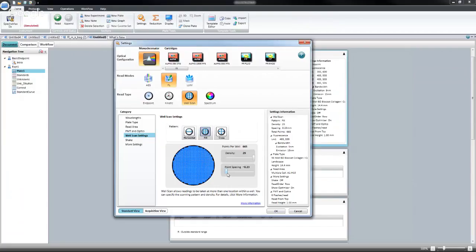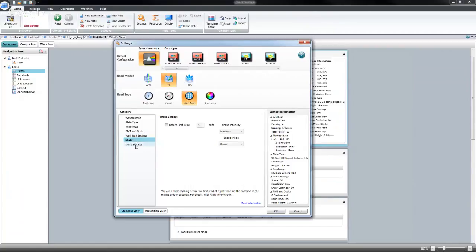And of course, it's really great. You can get a great idea of what's happening in each individual well here. But you can also space this out, which is a little more common, as it's not going to take that amount of time to read over 600 points. If you want to do, say, down to 12 here, it's a smaller sample size as well.